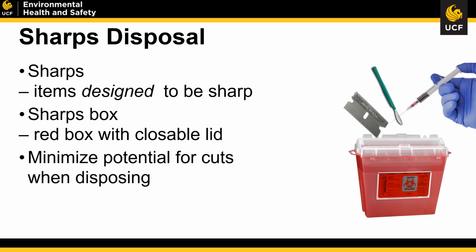Disposal could be simply placing it with your other hazardous materials to be shipped off, or if you're in a biolab, you may be able to take that sharps box and place it within your larger bio waste box and bag those together.